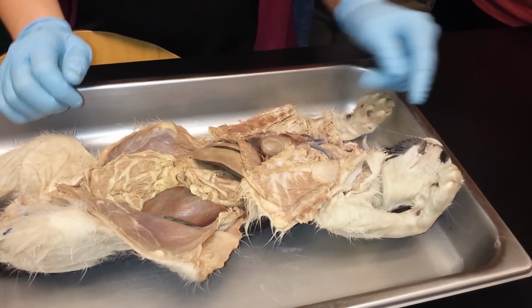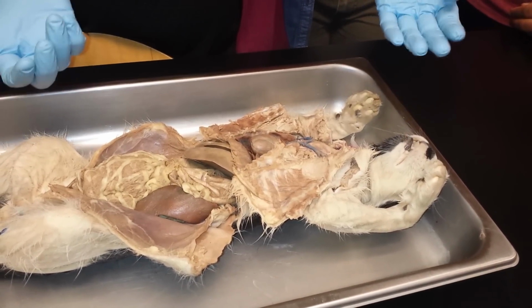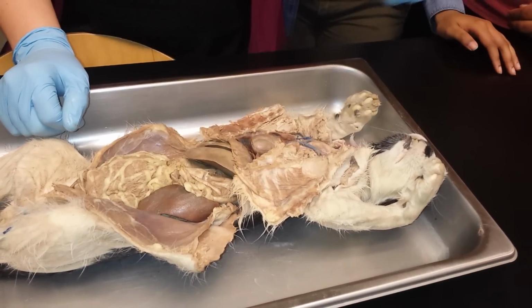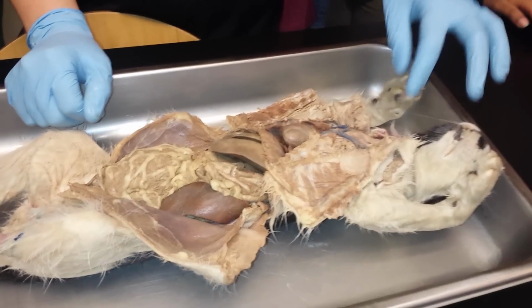Organs start up here. This is the oral cavity. Again, if I have a pin in here, you should be able to tell me it's the oral cavity. And then teeth, tongue, be able to know what those structures are and how they participate in digestion.